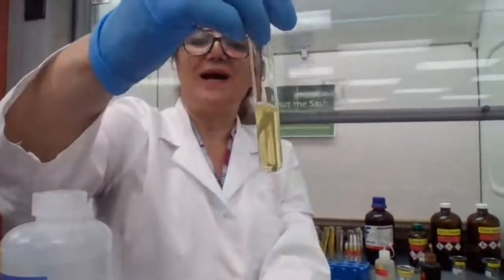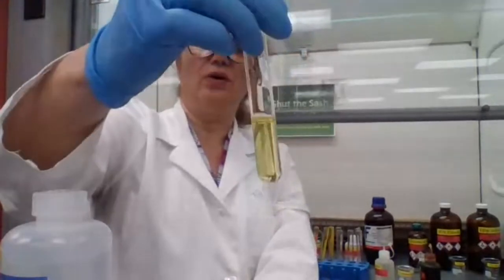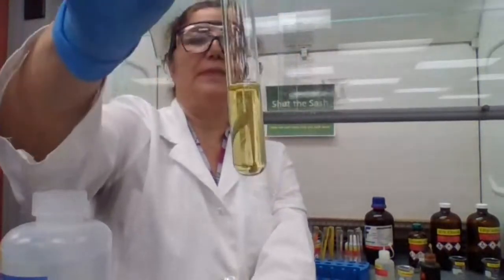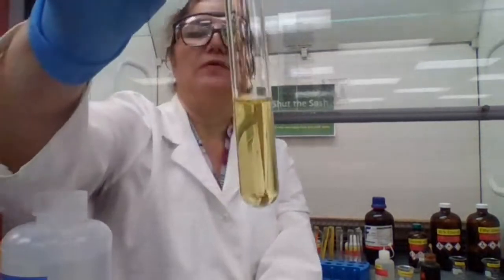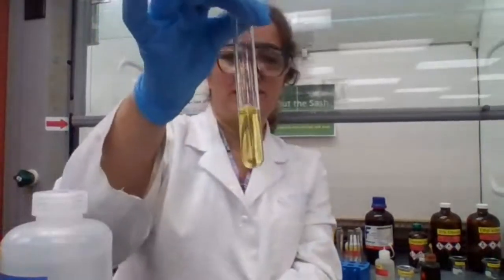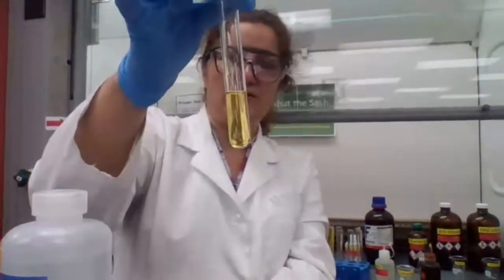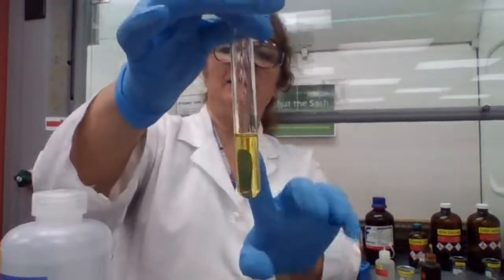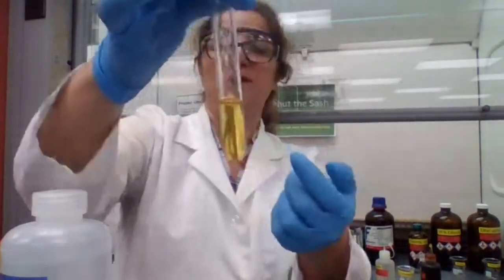So I don't have to add any more iodine. I can record a negative test for iodoform. Negative result for the iodoform, okay? And it makes sense because cyclohexanone is not a methyl ketone.